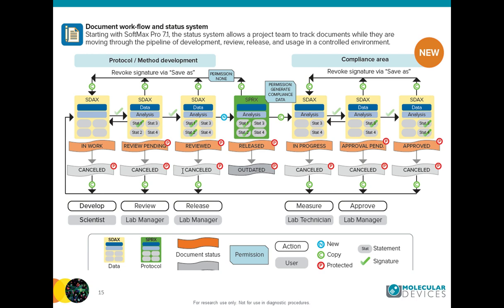Autosave in 7.1 is defined such that the scientist can decide if he wants to set it up or not. If he sets up autosave, he can define the file name and the storage location, or either of those. But in general, the scientist defines where the file will be saved and under which name.